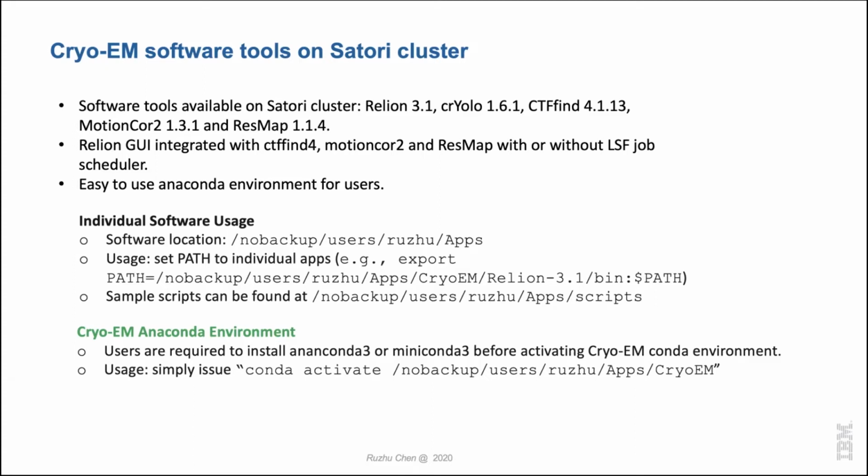Just activate it. It's not in the one here; I set it up in the project, in the BDDIR04 folder, and you just use the module load IBM collaboration and then you can activate it.